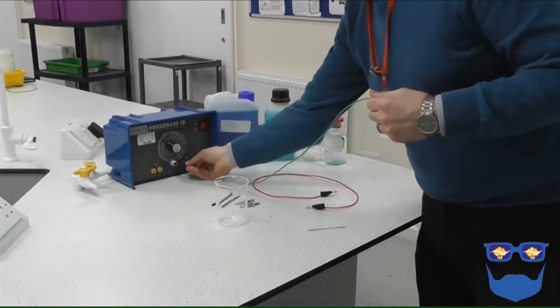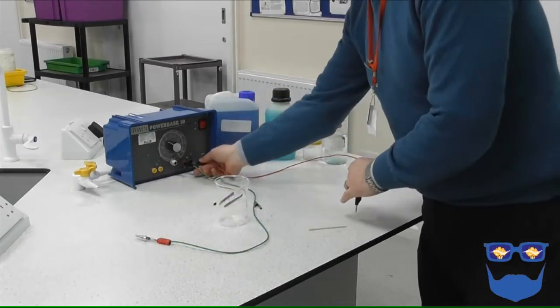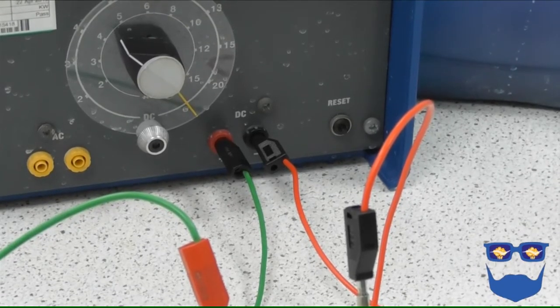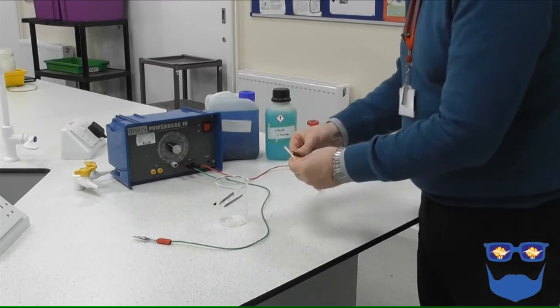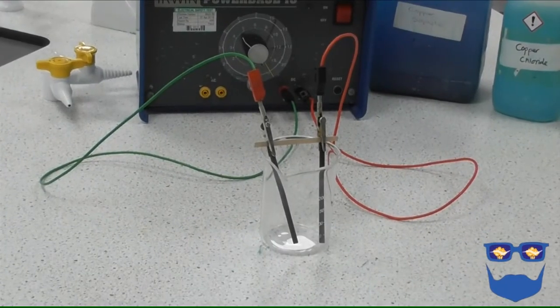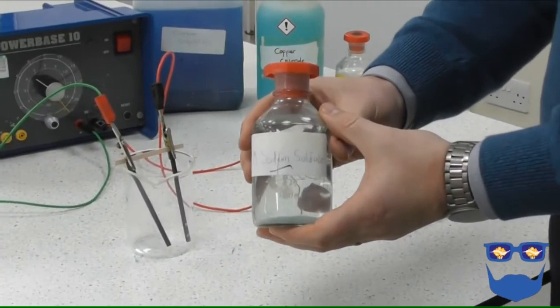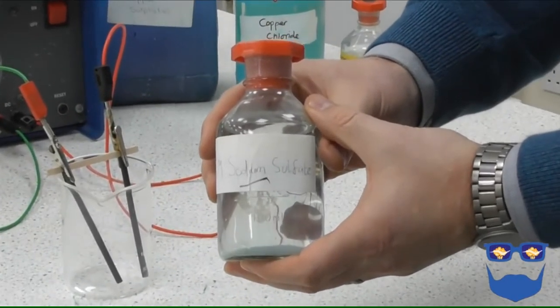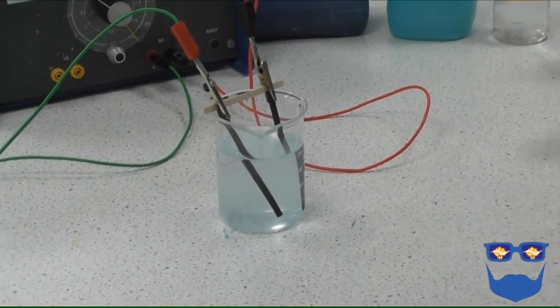Set up the experiment. Connect the crocodile clips to the leads, attach the leads to the direct current supply, attach the graphite electrodes to the crocodile clips, fill your beaker or the Nelson cell with one of the solutions. Insert the electrodes, ensure they don't touch.